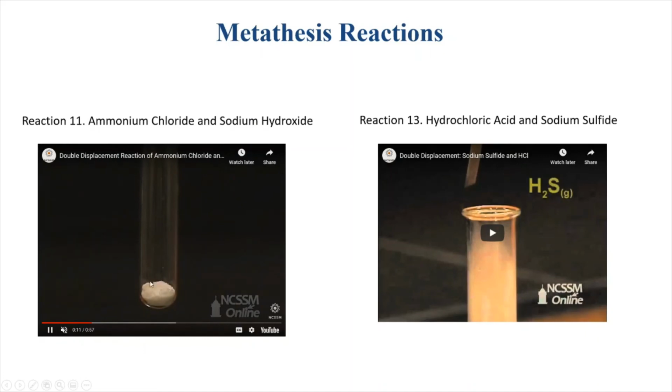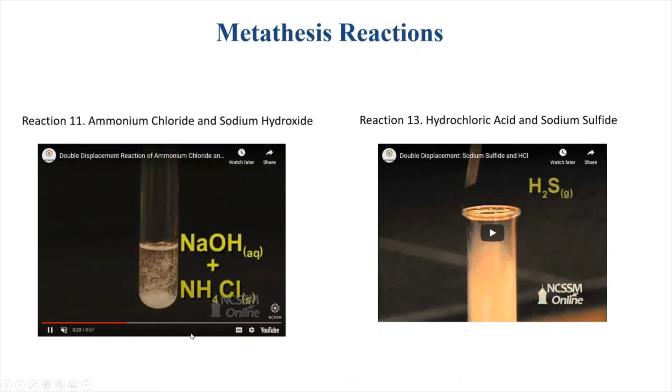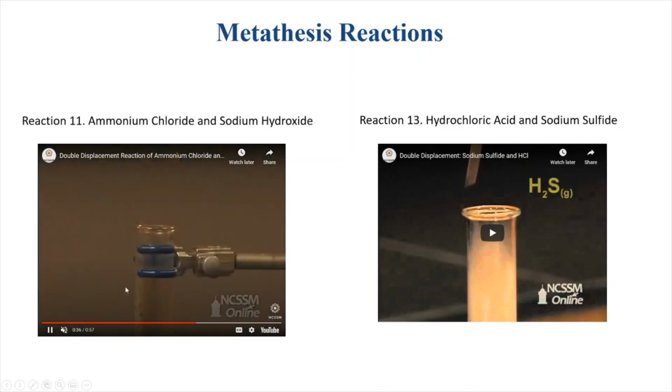So what they have down here is the ammonium chloride, that's a solid, and they're going to add the sodium hydroxide to it. And then they're going to heat it a little bit, but you don't really have to heat it. The reaction would produce the same effect without heating it. So they're going to heat it until it boils, but you don't have to do that. This gas forming that's happening here, this is just them heating it.